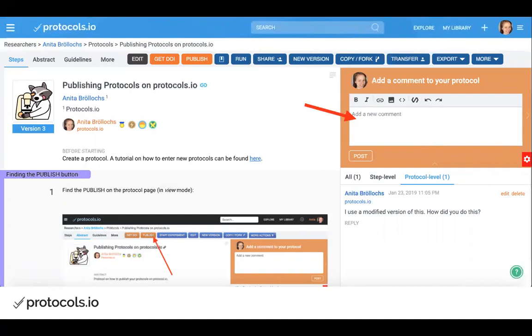Yeah, and so this can all be either public or private. So if it's private, you can always choose to remove the comments before publishing if you like to, or you can also keep the comments. And if it's public already, the comments usually stay.